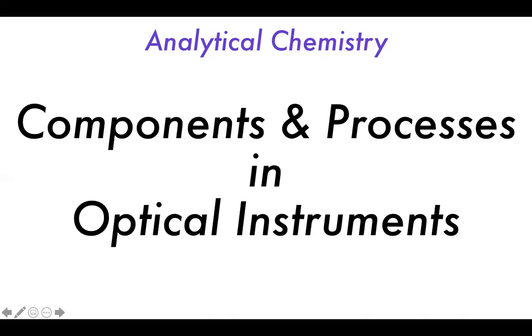Good morning, everyone, and welcome to this analytical chemistry class, where we'll be carrying on our discovery of instrumental analysis by having a look at some of the components inside of optical instruments. Last time we talked about waves and electromagnetic radiation, and how they interact with matter. Now we're going to have a look at some of the components that go into the design of these instruments and in some way tailor their response so that we can actually get meaningful results out of it.